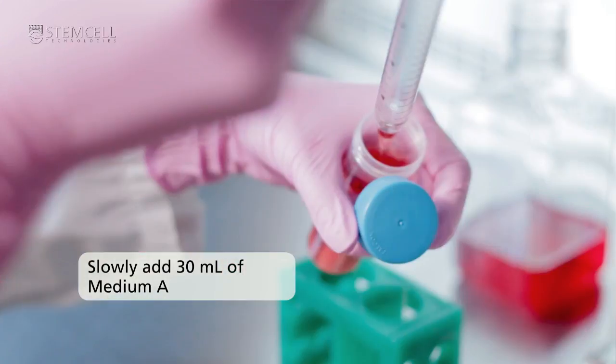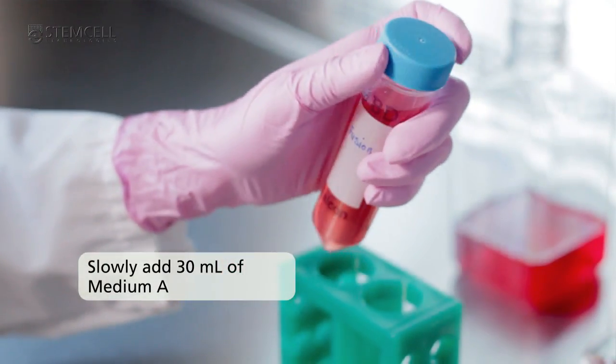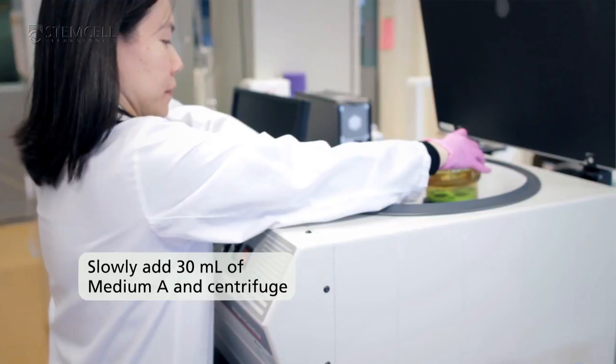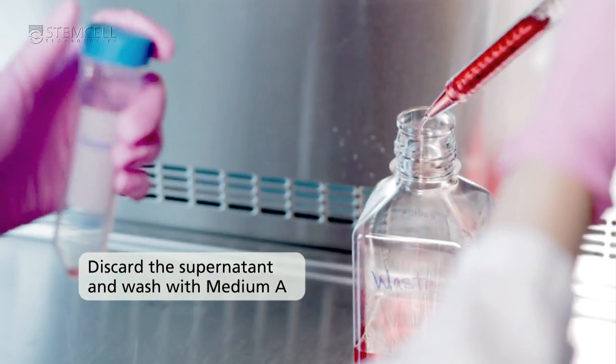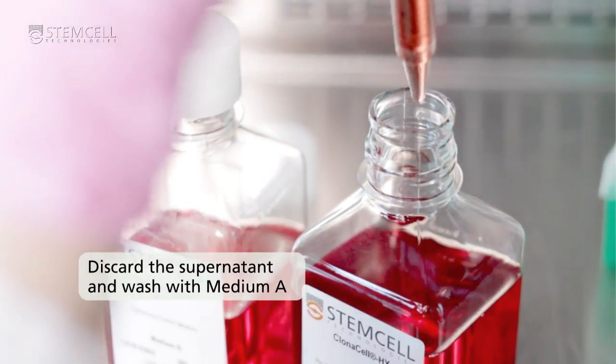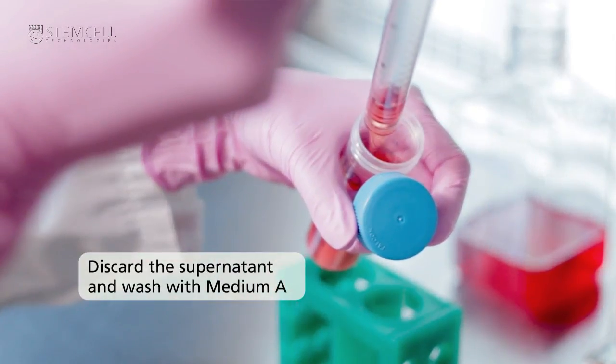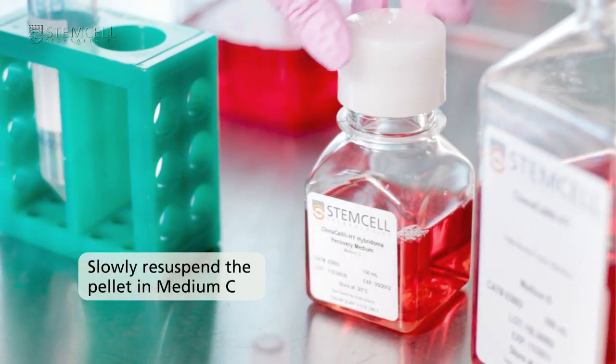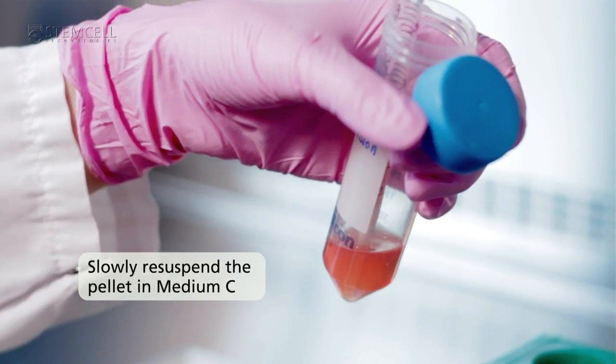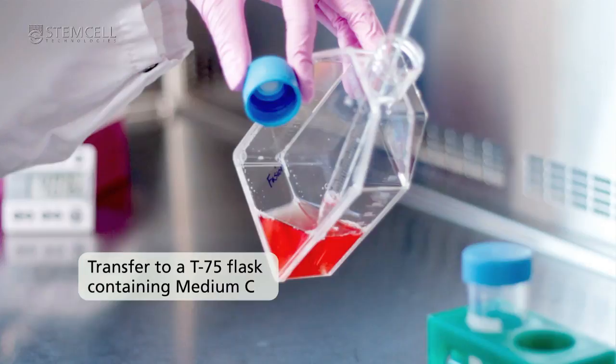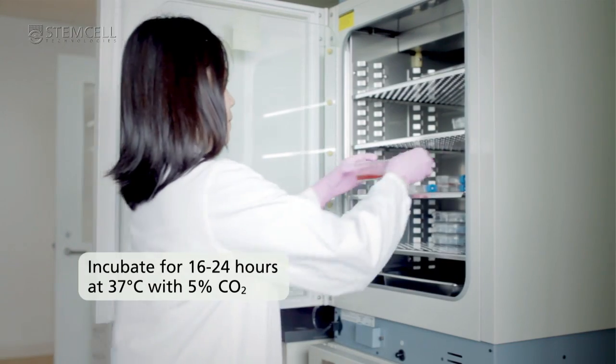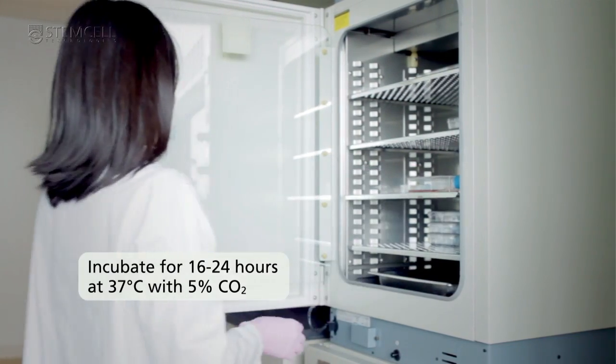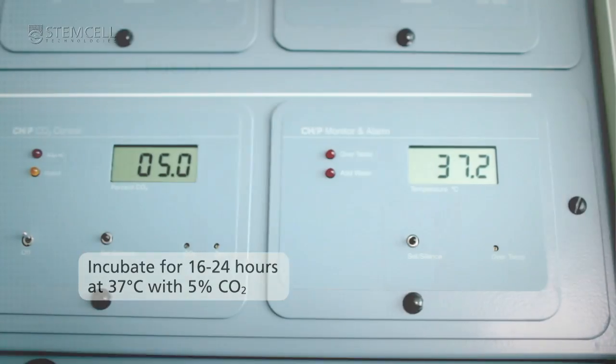Slowly add 30 mils of medium A and centrifuge. Discard the supernatant and wash with medium A to ensure that all the PEG is removed. Slowly resuspend the pellet in medium C. Transfer to a T75 flask containing medium C. Incubate for 16 to 24 hours at 37 degrees Celsius with 5% CO2.